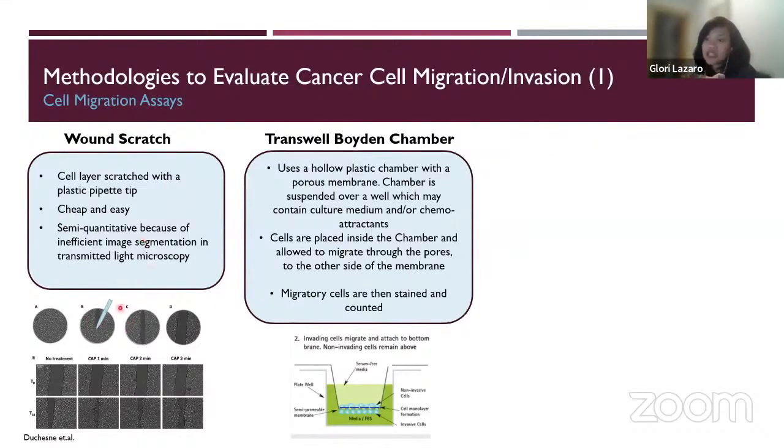And then you basically take a pipette and you scratch a line in the middle. And then you'll observe how they migrate towards each other. And so then you can add a drug or anything you want to see if it actually stops this wound healing process. And that's kind of indicative na, it may actually suppress or inhibit metastasis.